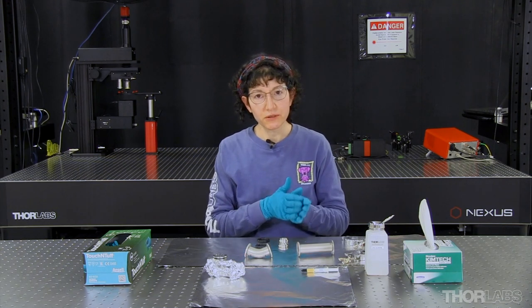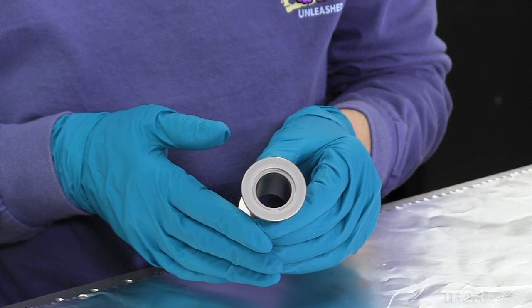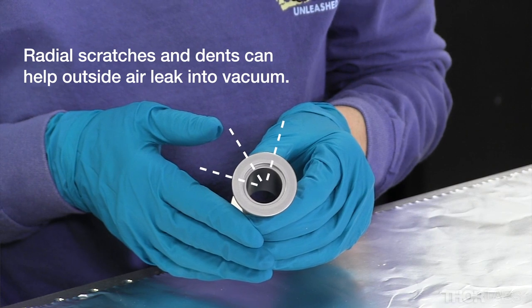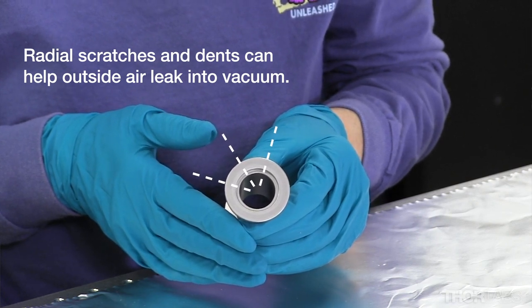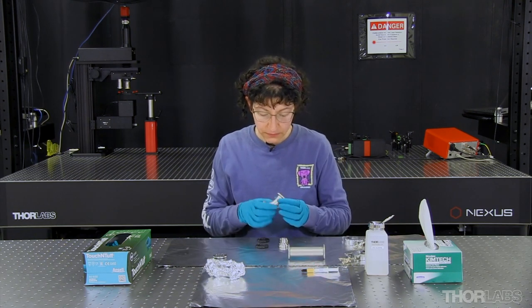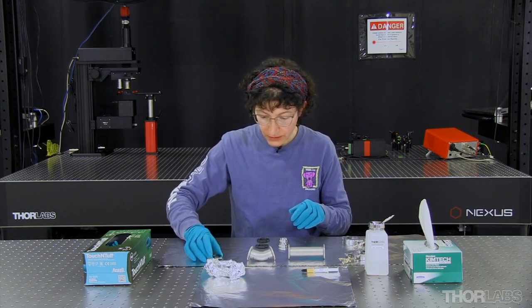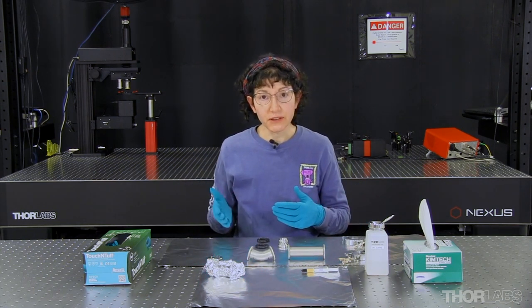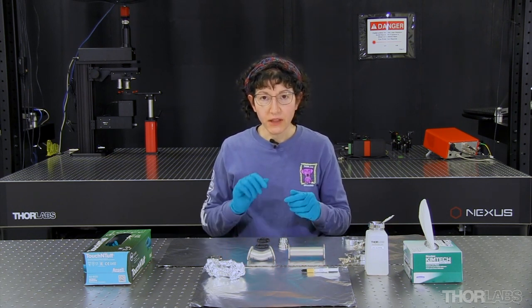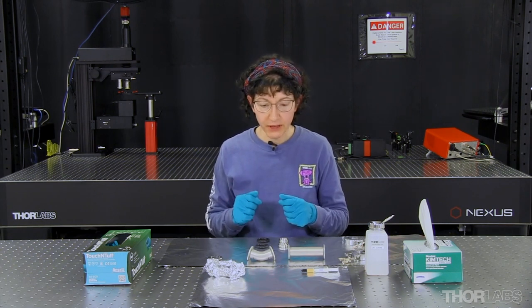Now I'm going to move on to examining the flanges. I don't want to see scratches or dents. Particularly worrisome are scratches and dents that extend from the vacuum side of the flange to the atmosphere side, since those are more likely to cause leaks. They appear to be in good condition. Now that I've done the first examination, in order to prepare these parts to be coupled together, they need to be cleaned of any superficial dirt, dust, or fuzz that might have collected on them.